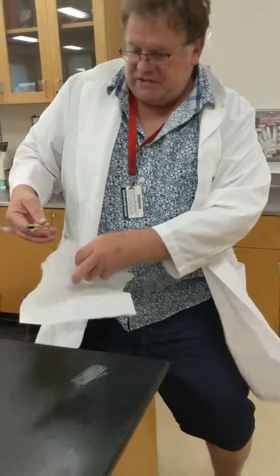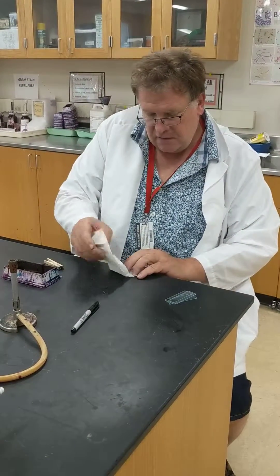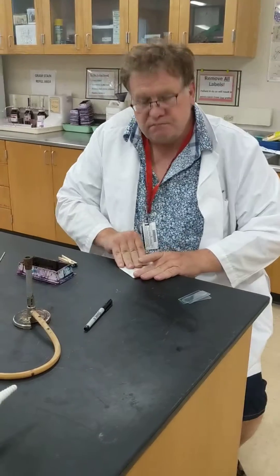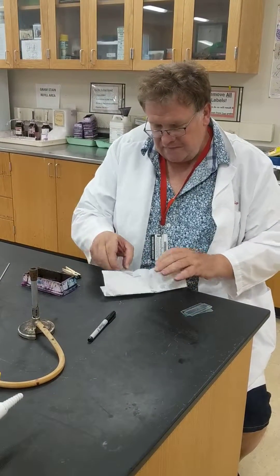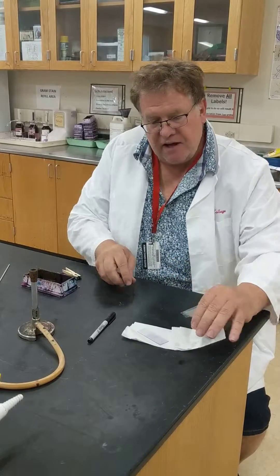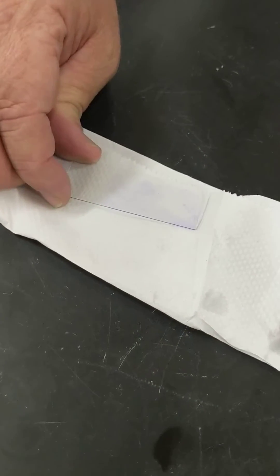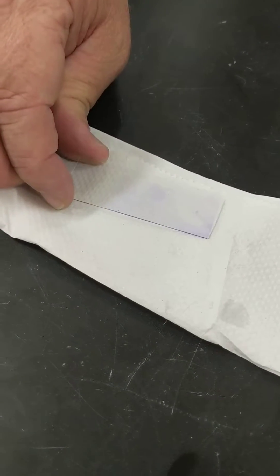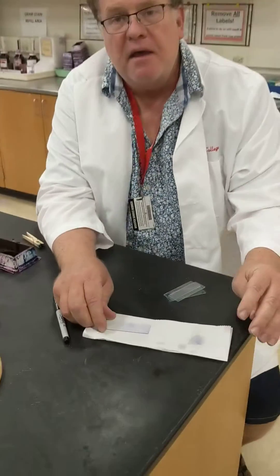Then take a paper towel just like this and blot your stain. If everything worked out correctly, you can see that the light smear we saw before is now stained. Next thing we need to do is look at it underneath the microscope. This is Nick Kapp and that was your Microbiology Lab Minute.